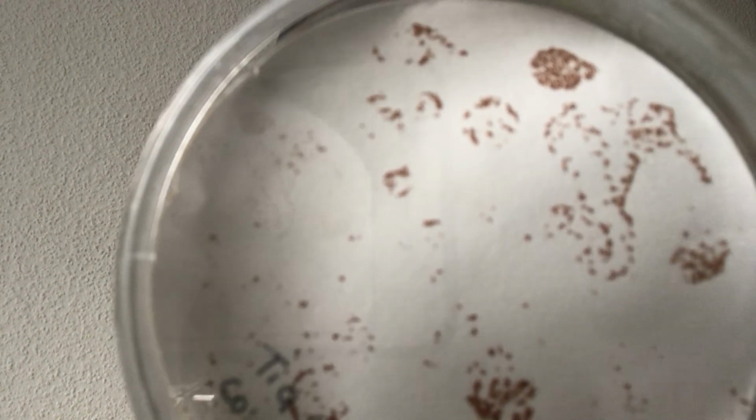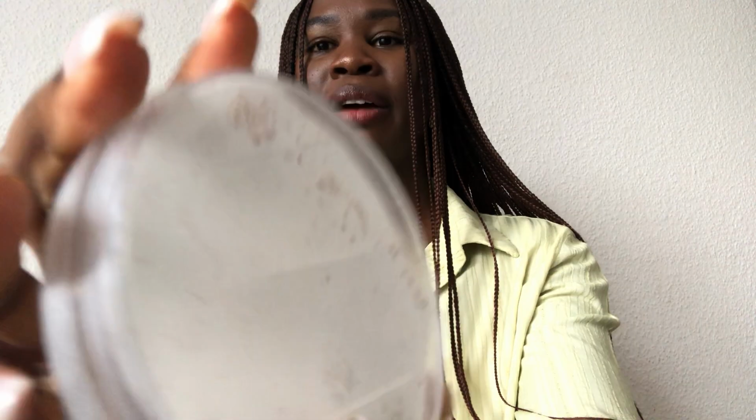So I have, for instance, here Arabidopsis thaliana seeds. There could easily be 1,000 seeds here. The seeds are so fine. Maybe you can see from the back, the seeds are so fine that almost 1,000 seeds can fit in this one petri dish.